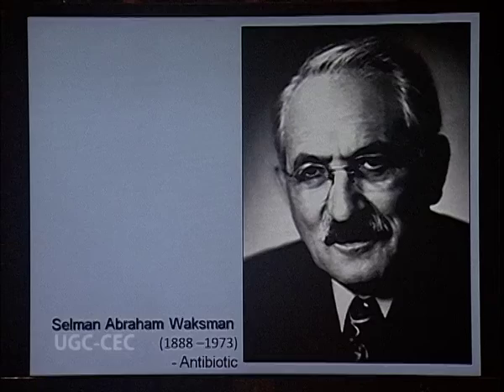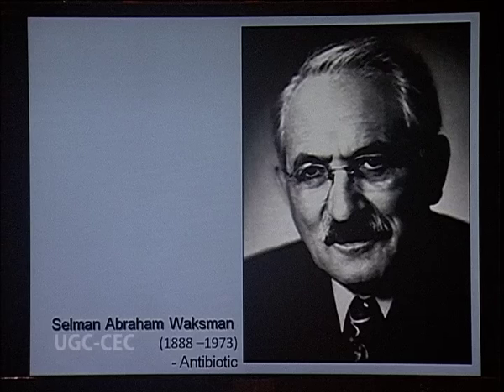Welcome to this lecture on antibiotic sensitivity assay, or microbial bioassay of antibiotic. In this lecture, we'll be discussing the different aspects of antibiotic bioassay on microbes. The term antibiotic was coined by Selman A. Waksman in the year 1942, meaning an organism preventing the growth of another organism through some secondary metabolite.